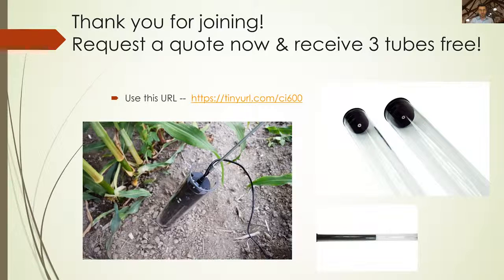The next question, it looks like, is how many times can one tube be used? The tube actually can be used for years on end. The most important part is that the tube just doesn't get scratched up and damaged, so you're not really getting a clear viewing of the surrounding root system. Using acrylic, we have found that has mitigated a lot of the problems of past different substances. But if you have rough ground, like when you're doing your installation, that's when you're going to be getting most of the damage done.